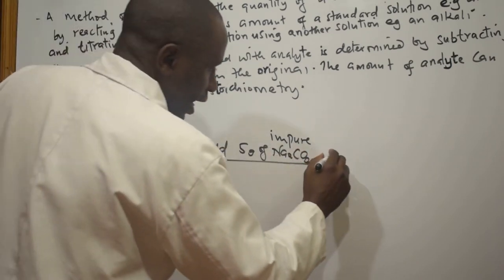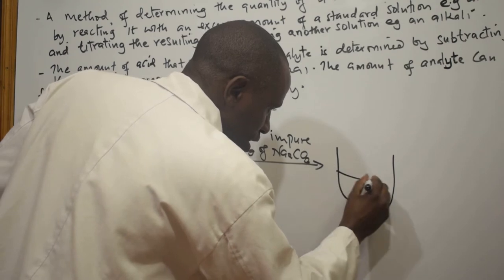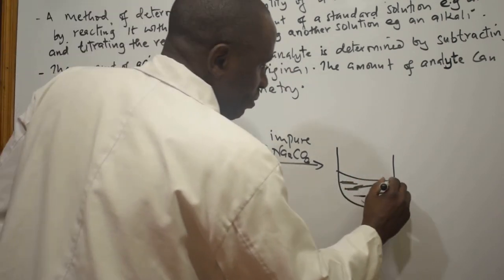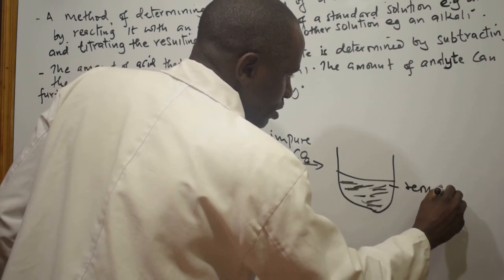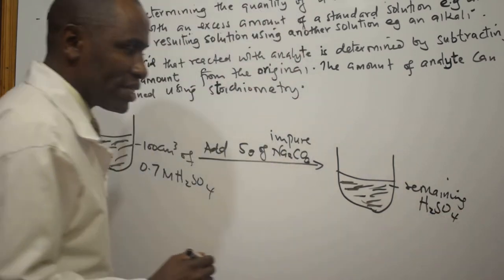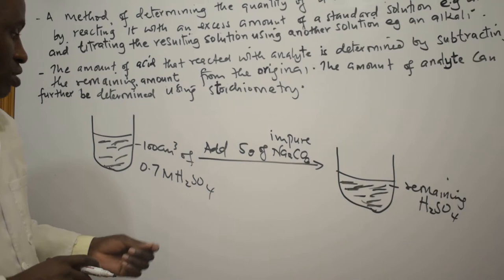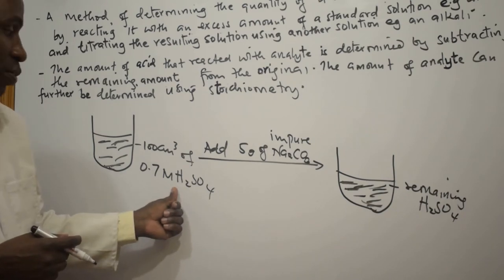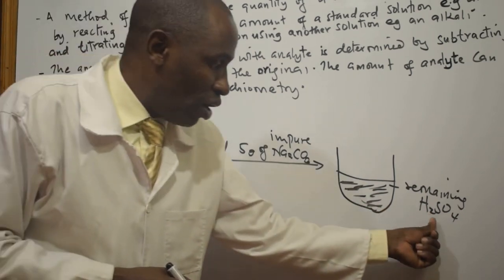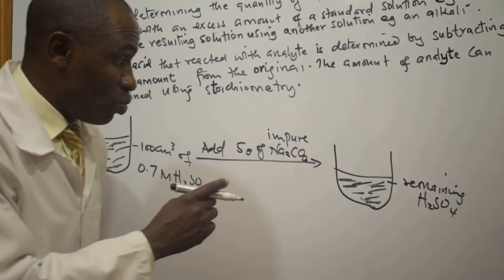Then, if you look at the resulting solution here, it will contain the remaining sulfuric acid. Of course, we are going to have salt, that is sodium sulfate, and we are also going to have water. So this is what we're going to have here.